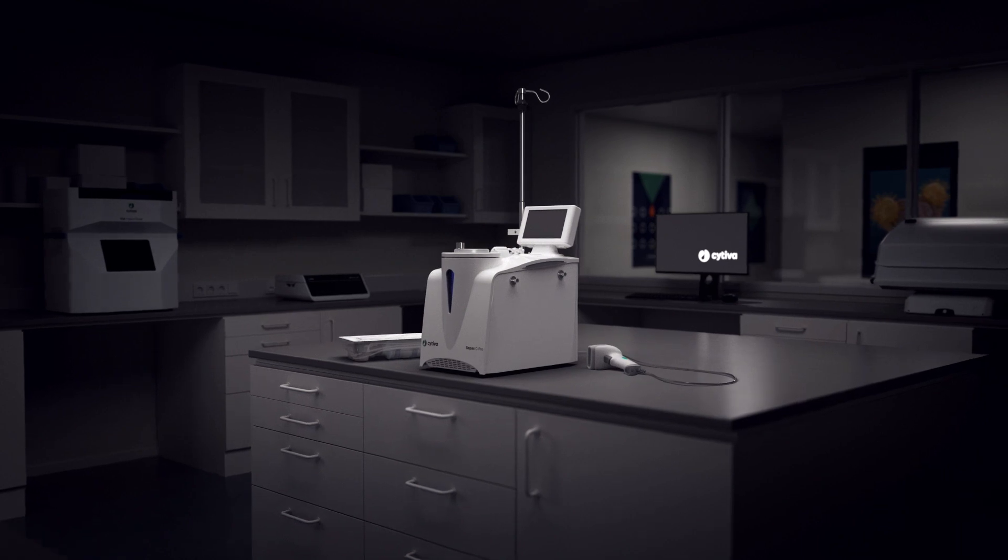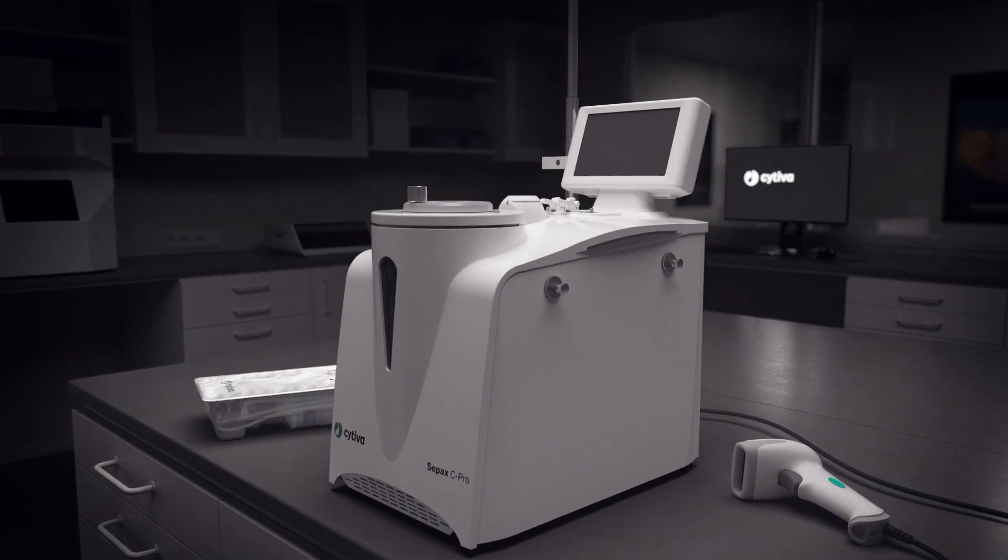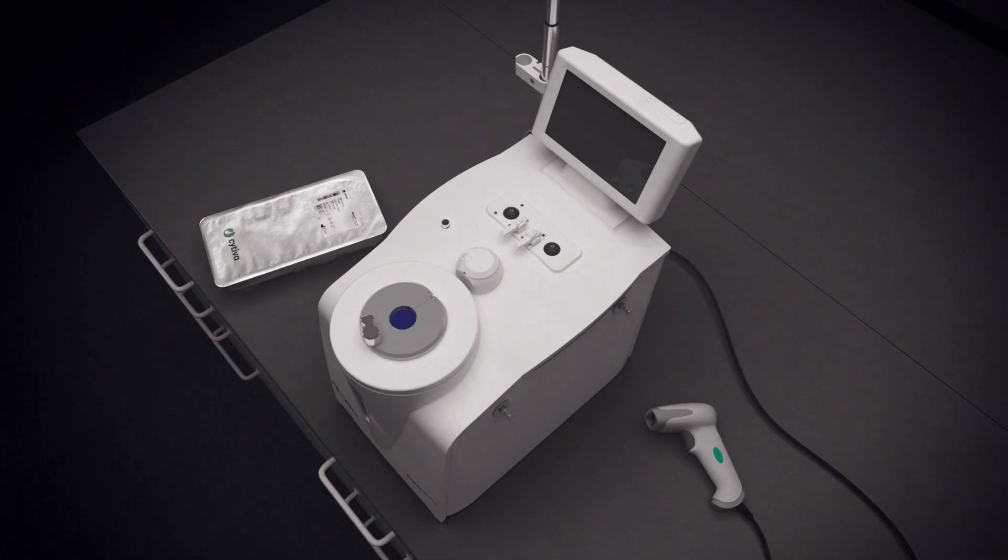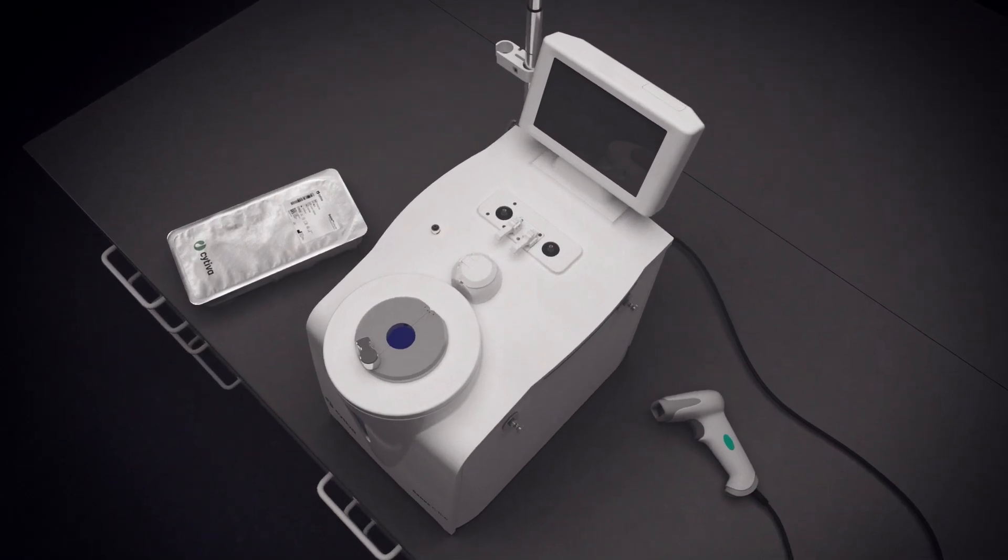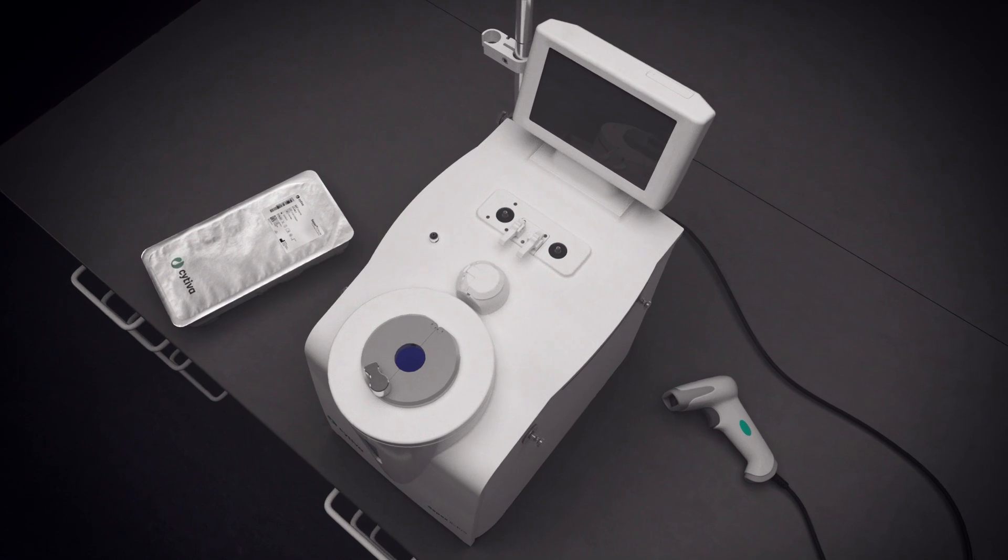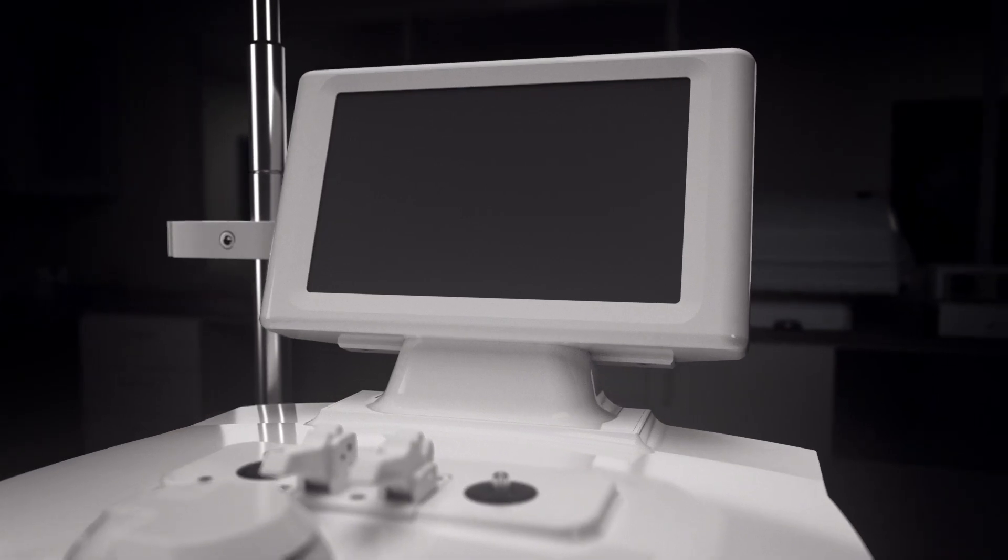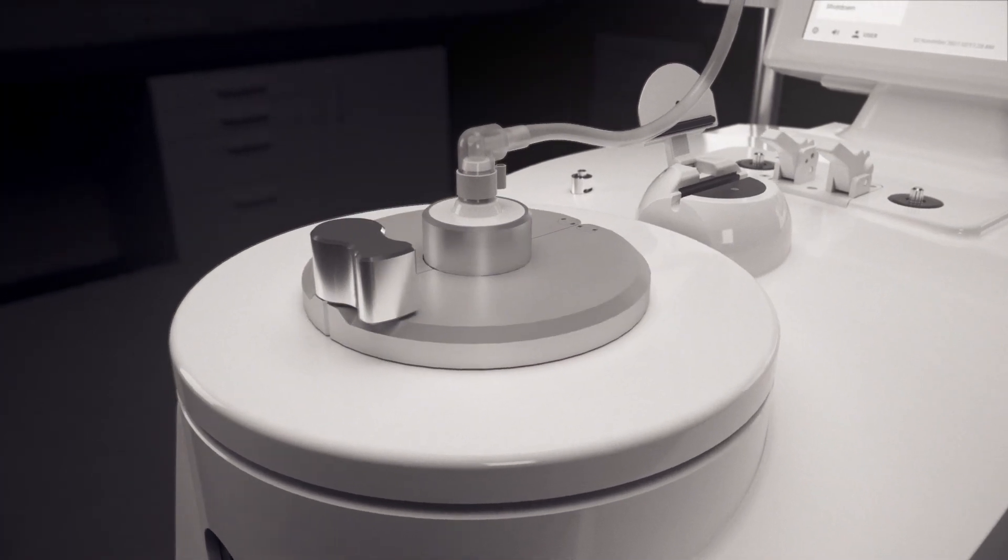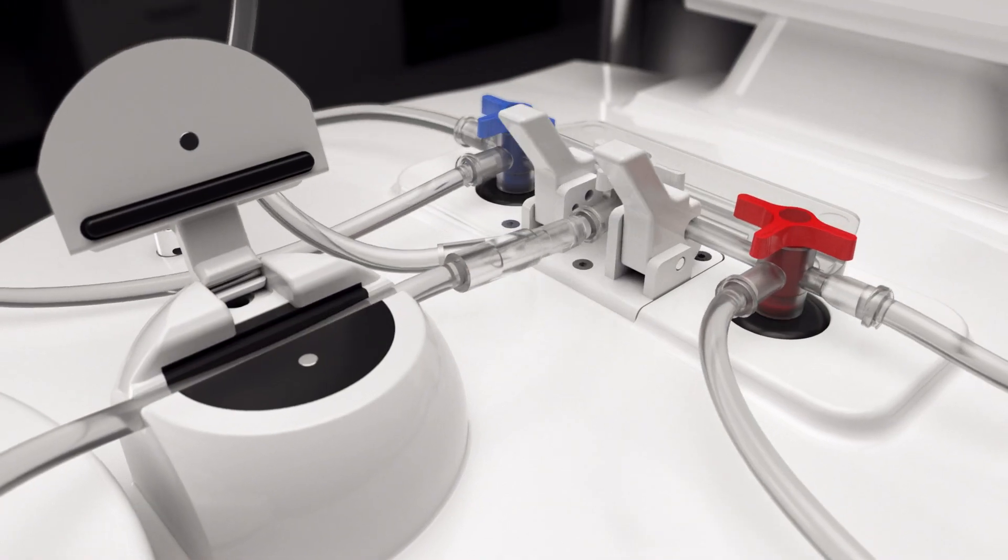CPAC's CPRO Cell Processing System is an automated and functionally closed platform that processes cells for cell therapy products. The instrument, application software, and single use kits let you combine processing steps in a versatile way.